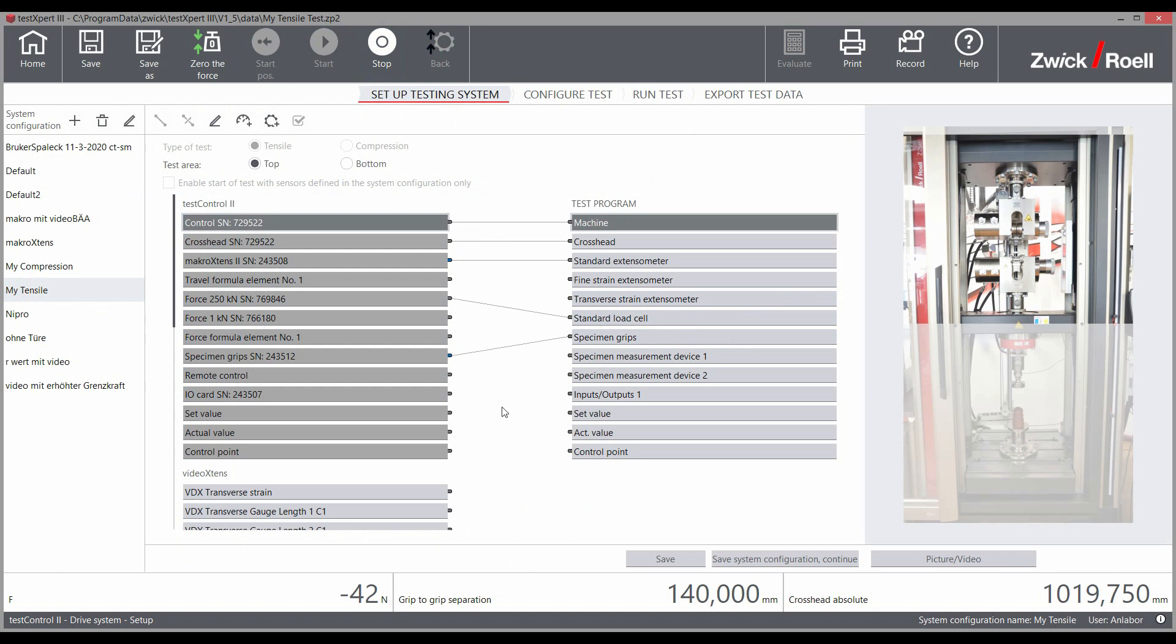An image can also be stored for each system configuration. These images provide the operator greater assurance since the respective image shows the corresponding system configuration.